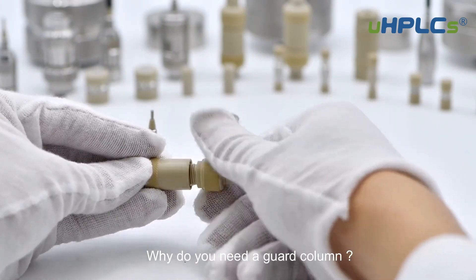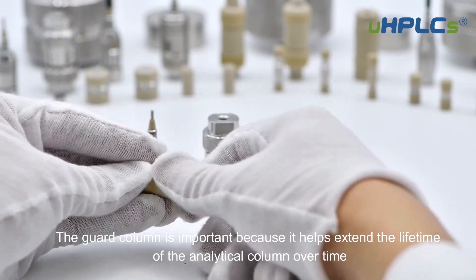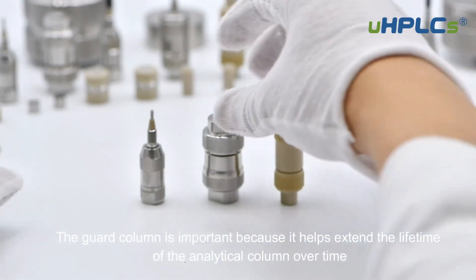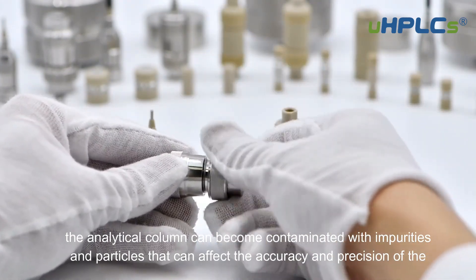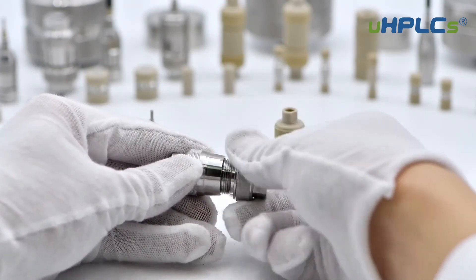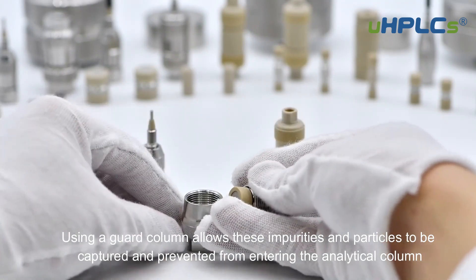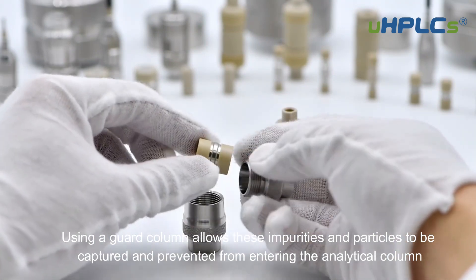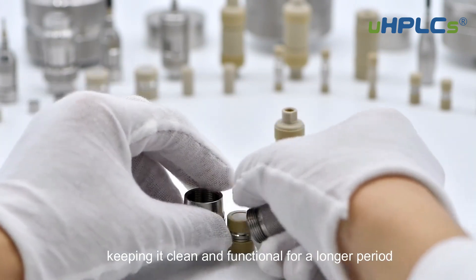Why do you need a guard column? The guard column is important because it helps extend the lifetime of the analytical column. Over time, the analytical column can become contaminated with impurities and particles that can affect the accuracy and precision of the analysis. Using a guard column allows these impurities and particles to be captured and prevented from entering the analytical column, keeping it clean and functional for a longer period.